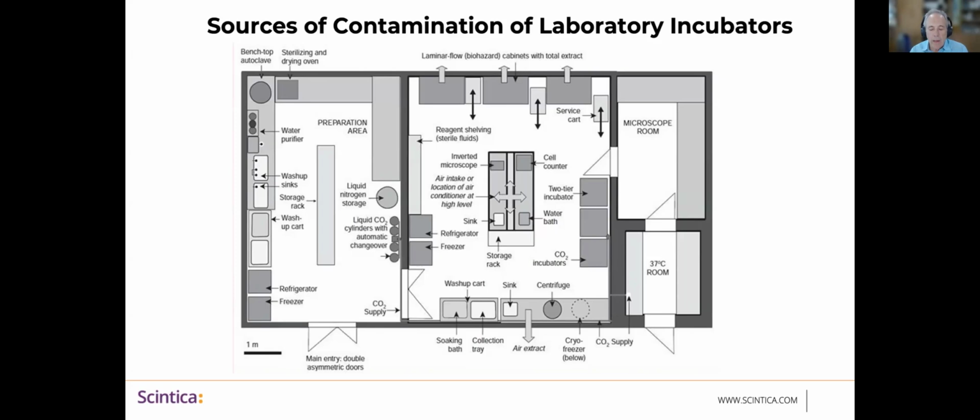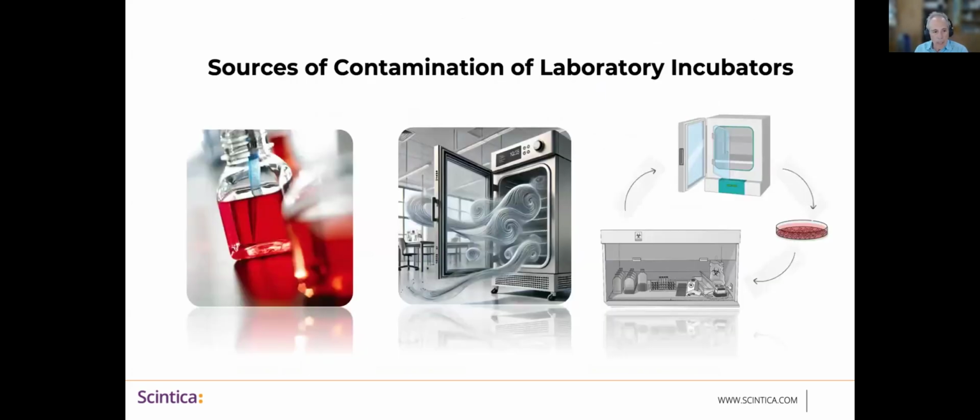Now I realize that most of us don't have the luxury of designing our lab from scratch. And so we have to think about where we put our equipment in the lab in order to minimize the risk of contamination. There's a number of sources of contamination that we mentioned: air eddies, which we can see in the cartoon in the middle of this page. Every time you open the incubator door, you're pulling in or creating eddies that have potential to introduce contamination from the air inside the laboratory.